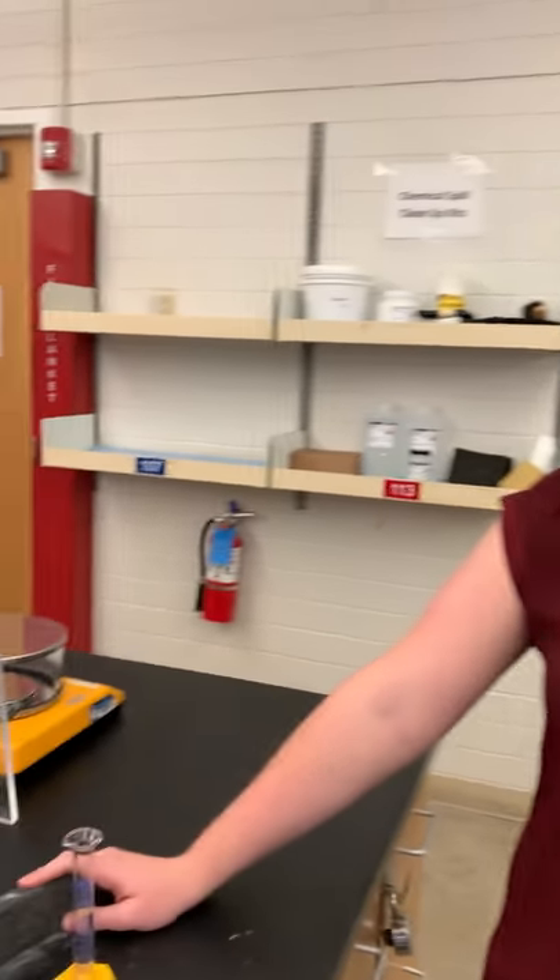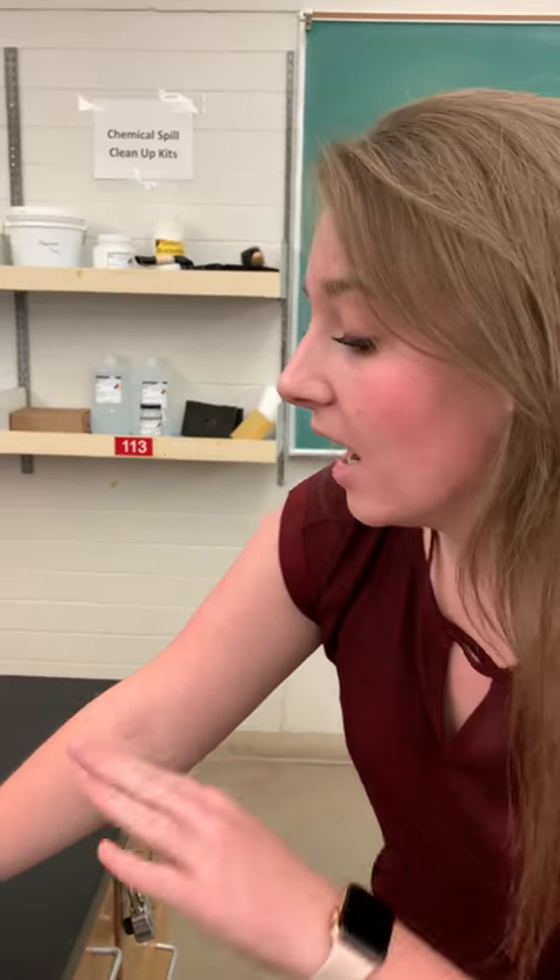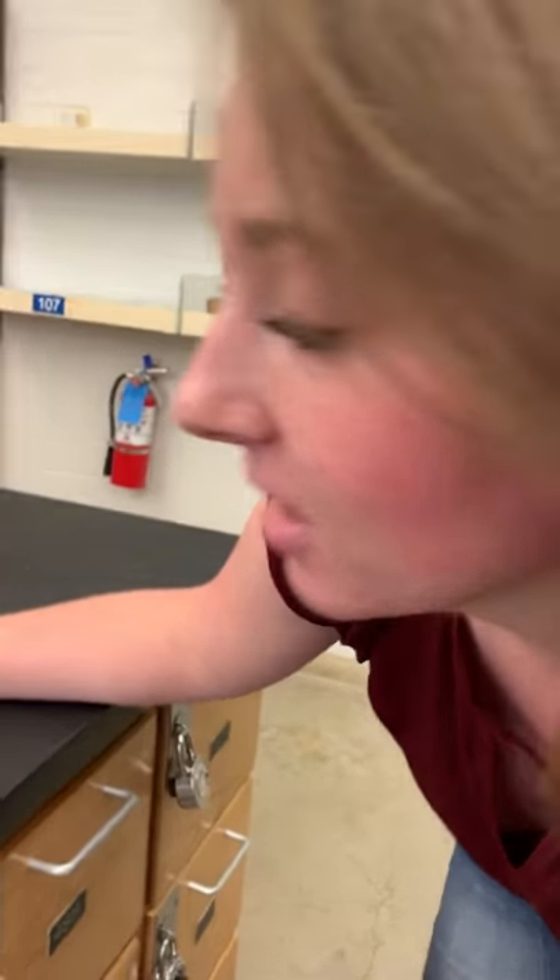We filled up the cylinder with water and we're going to be using a black object to put behind the cylinder so we can see it easier to measure it. We need to get our eye level so it is level with the meniscus so we can see better.